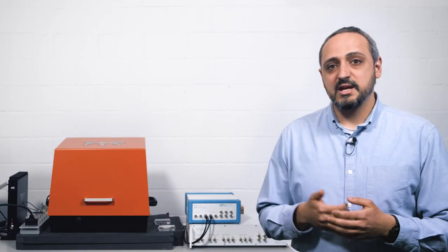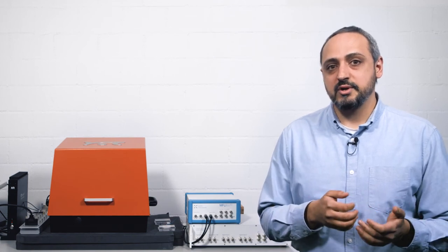Although it provides better spatial resolution, the FM sideband KPFM can suffer from a reduced signal-to-noise ratio.